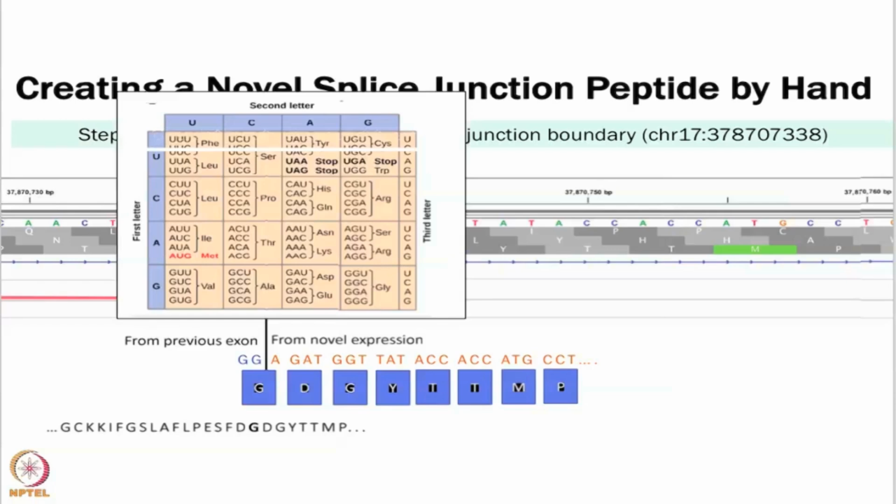These two are going to join because this is the junction, so these two will join. And here there is no joining, but here it is joining. You can detect alternative splicing.